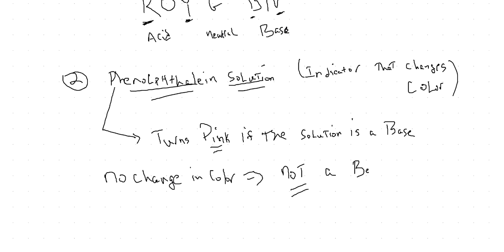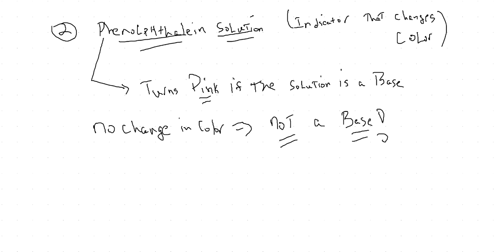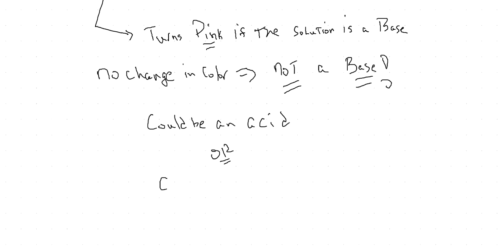Doesn't that mean it's an acid? No, it doesn't. It could be an acid, or remember, it could be neutral. You don't know which. All we know is if it doesn't change color, it's not a base. If it changes pink, then we definitely know that it's a base.